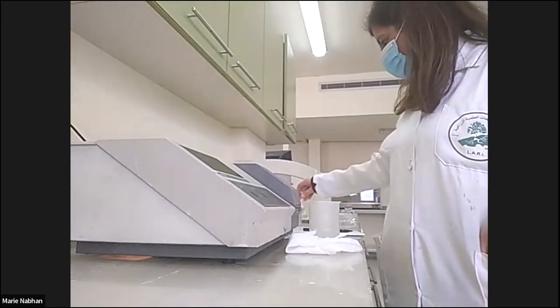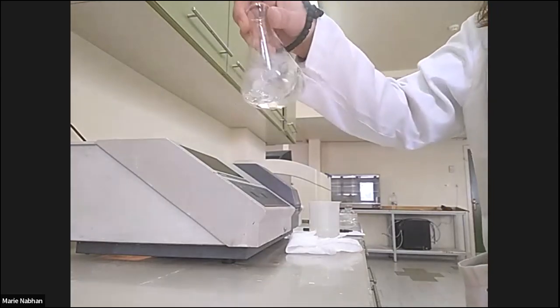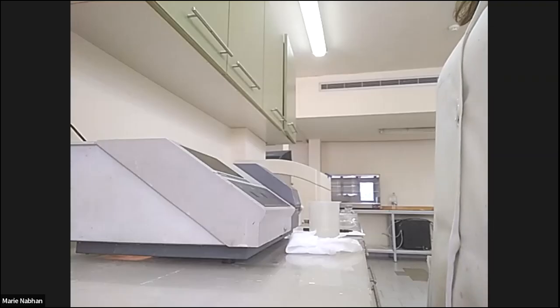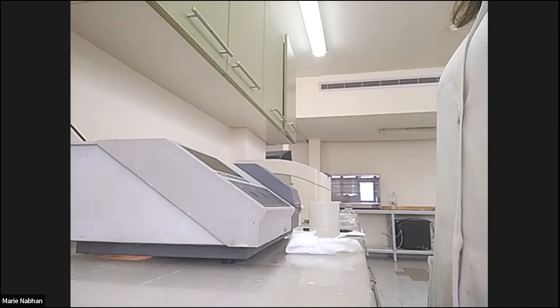It may also need some time to develop the sulfate in the suspension, not immediately. It's still clear. For water, we did the same. If you have potassium dichromate, add a drop. Potassium chromate, as for chloride. Yes.